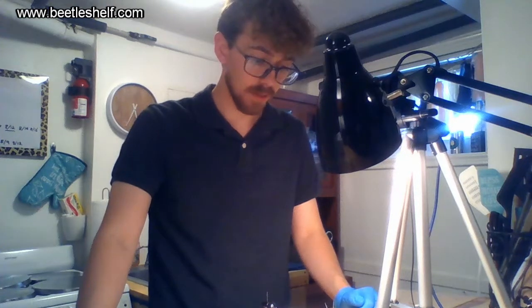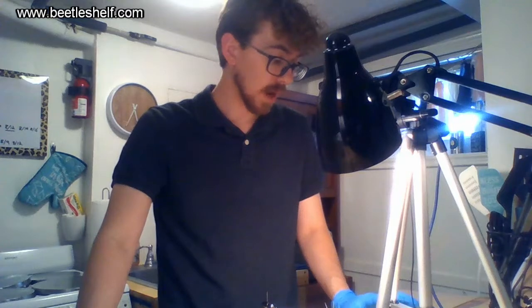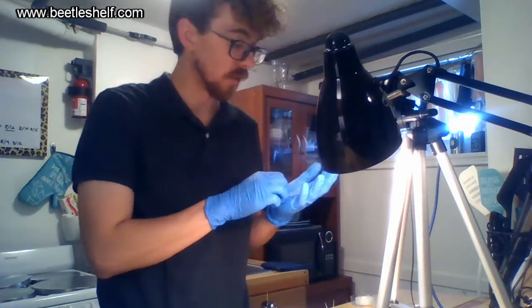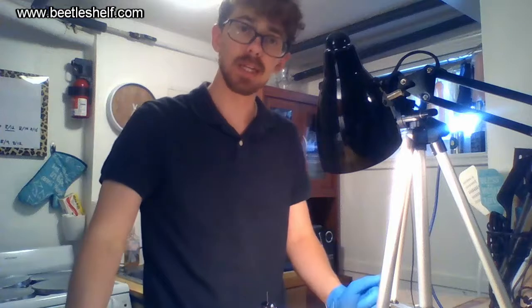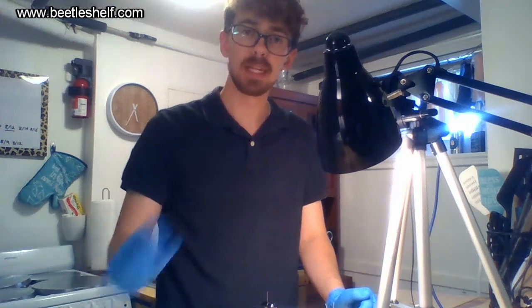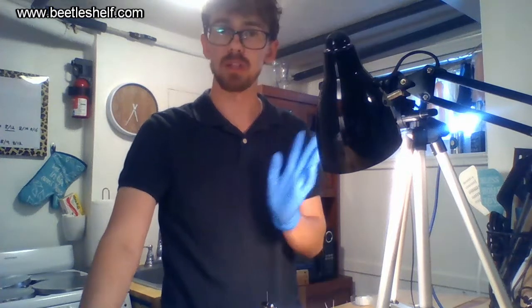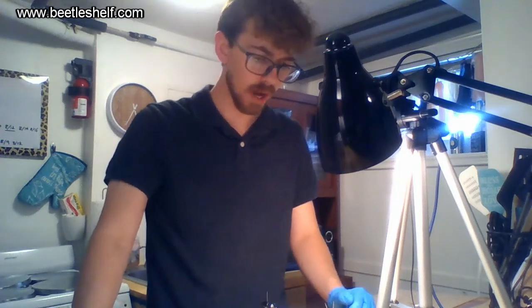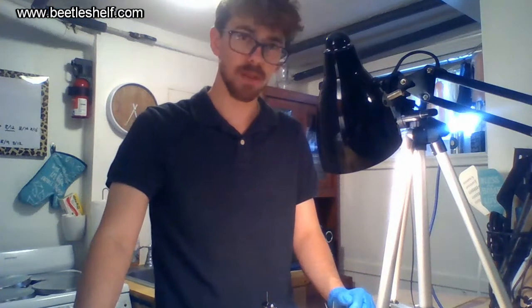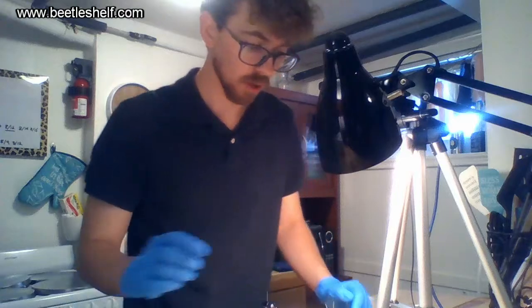If you're wanting to pin a specimen that you've already kept alive, the most humane way to kill an insect is by freezing it — put it in a small container and freeze it. The next day it'll be ready; you can leave it in there as long as you want. When you pull it out, give it an hour or two to thaw, and then for the next few days it'll be pretty malleable so you can pin it.